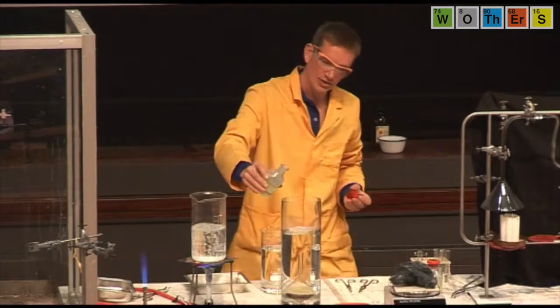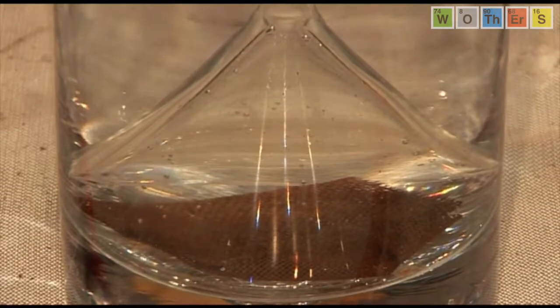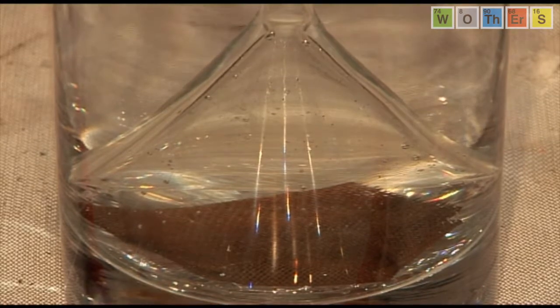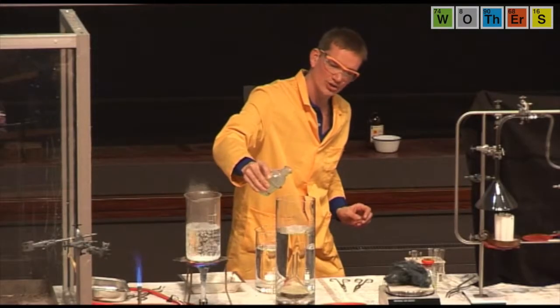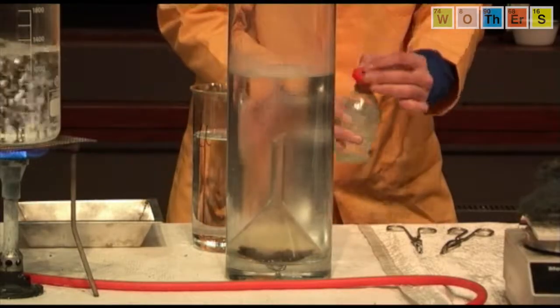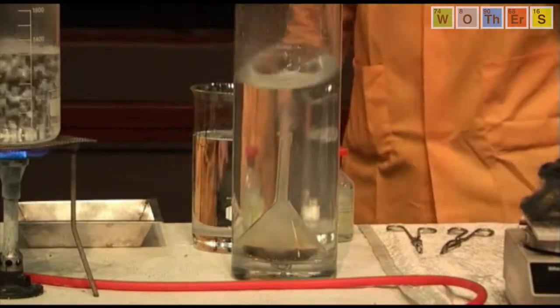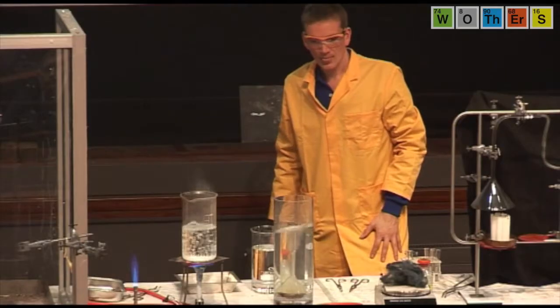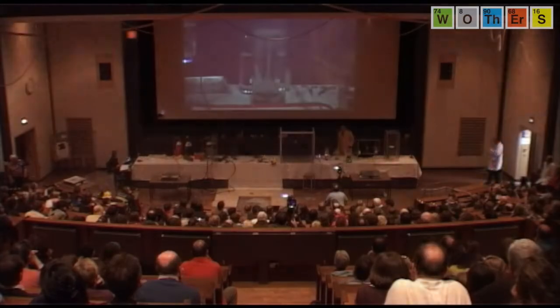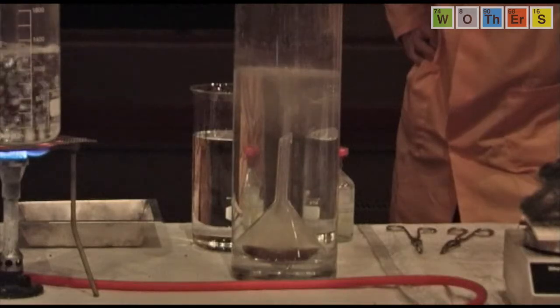So I'm going to add some acid to the container here. In the bottom we have a funnel with a compound called magnesium silicide, and as soon as it comes into contact with acid, we get a gas called silane, SiH4. And any second now we should see some bubbles forming. And the bubbles, when they come into contact with the air, I hope, should catch fire, all by themselves.